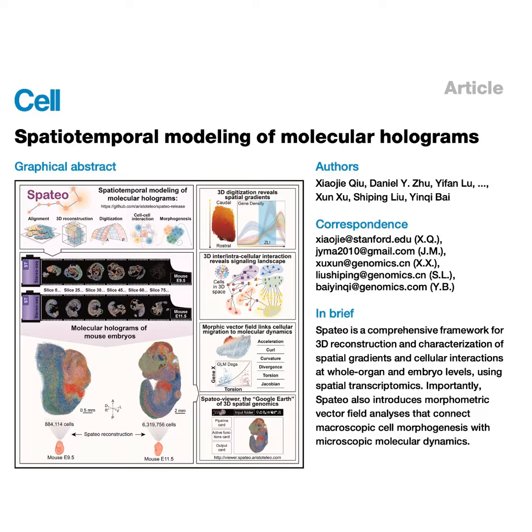To prevent that, Spateo implements multi-slice refinement. It doesn't rely solely on pairwise alignment. Okay, so what does it do instead? It anchors the calculation by analyzing a rolling neighborhood of slices, usually like 3 slices forward and 3 slices back. By jointly modeling the spatial transcriptomics of an entire block of tissue simultaneously, the algorithm creates a sort of moving average of structural integrity. So it prevents those tiny localized adjustments from accumulating into a macro-level distortion. That solves the stretching and tearing.